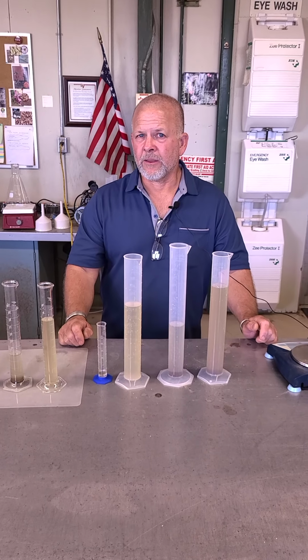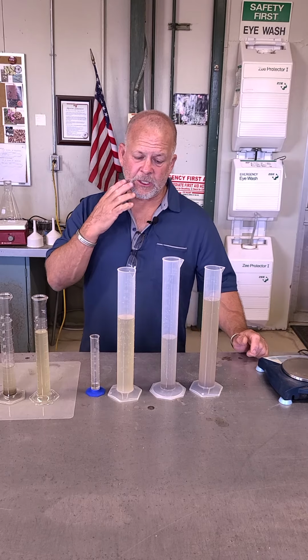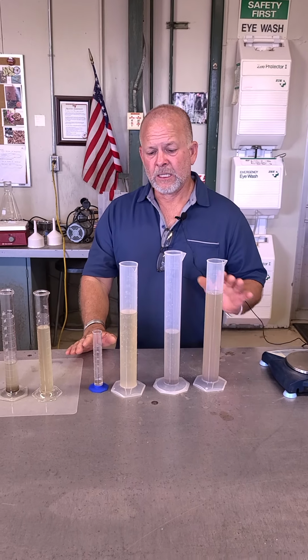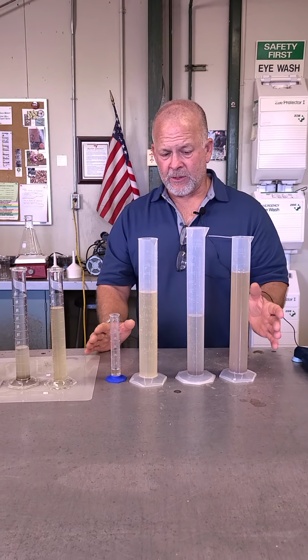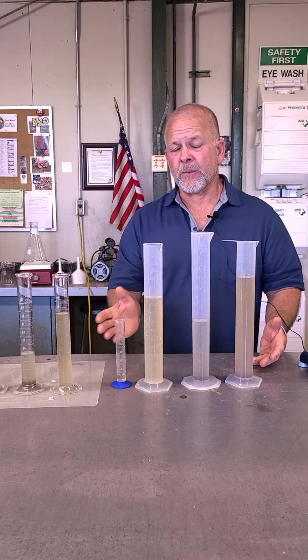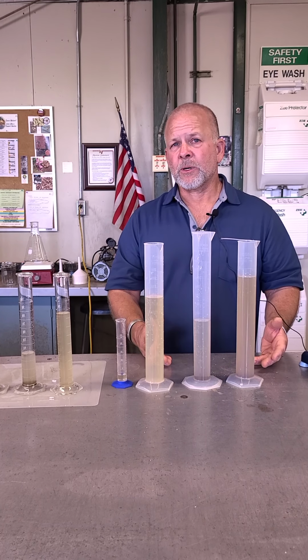Okay, so we're on the final part of our first run of 3 for this particular experiment, and so I wanted to, this is a much more visual way of looking at it. So you can see here on the loam, you can see what's happened with the different treatments based on the amount of water, I say water, but the soil solution that's actually come through each one of those different treatments.